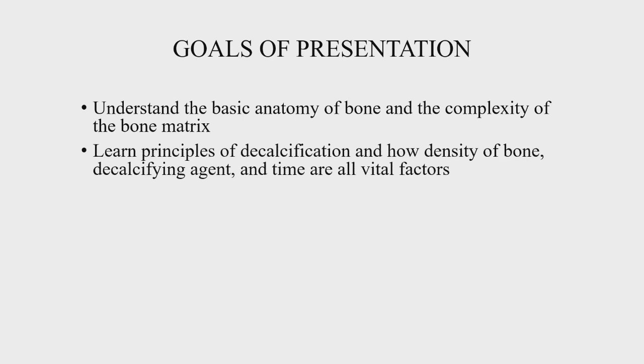The next goal is to learn the principles of decalcification and how density of bone, decalcifying agent, and time are all vital factors. And what I was going to say about this is that years ago, even when I first started in histology, in my lab when I was being trained, it wasn't thought of as a science. I was just told to put it in this solution and check it later. No one said anything about monitoring or timing. When it was soft enough, you would know. And that was basically the science behind my initial learning of bones.